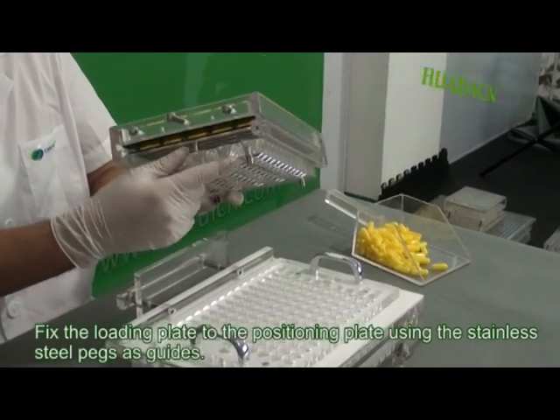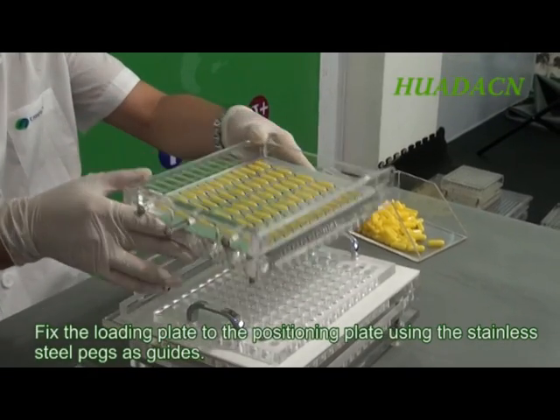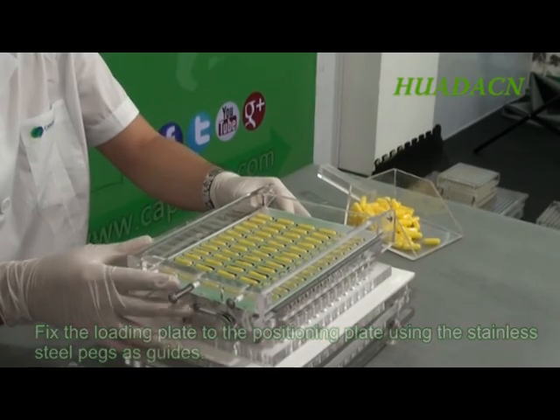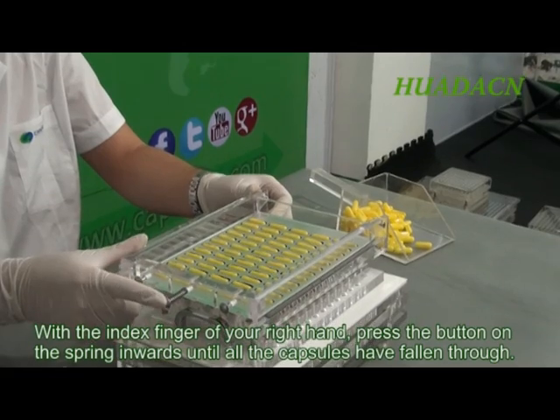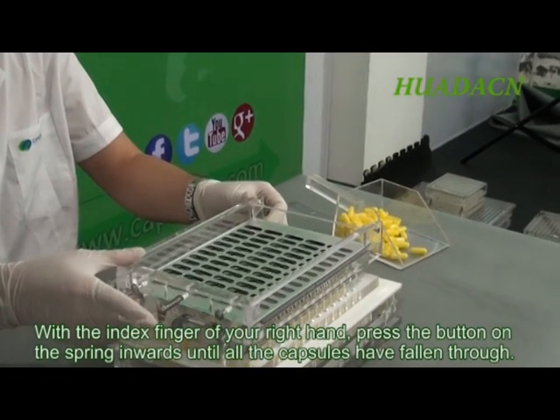Fix the loading plate to the positioning plate using the stainless steel pegs as guides. With the index finger of your right hand, press the button on the spring inwards until all the capsules have fallen through.